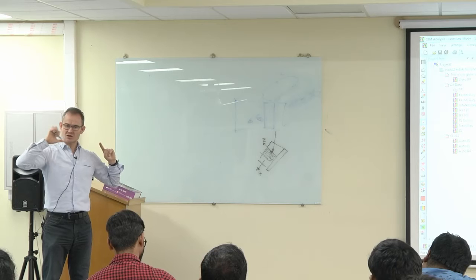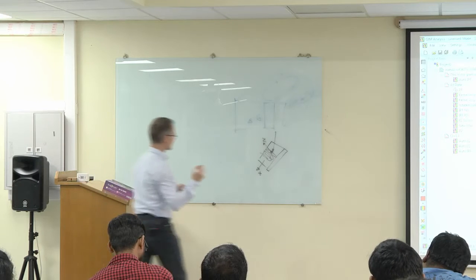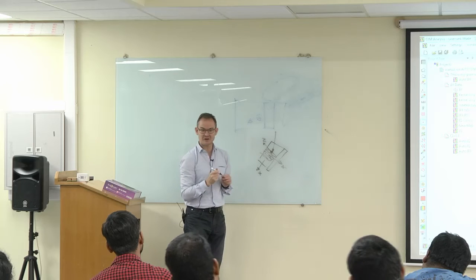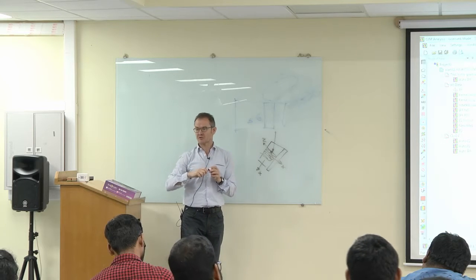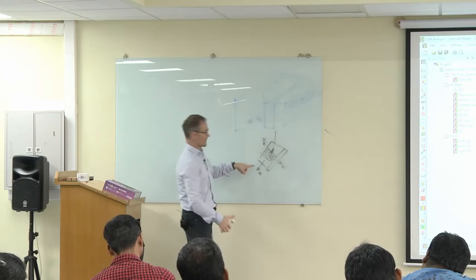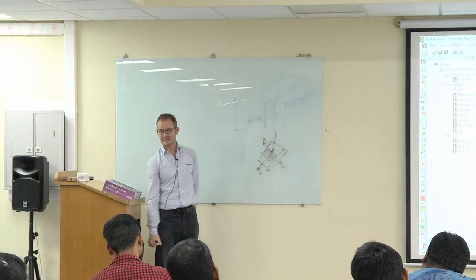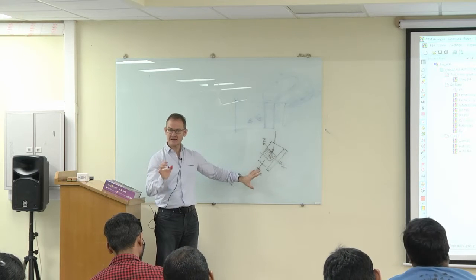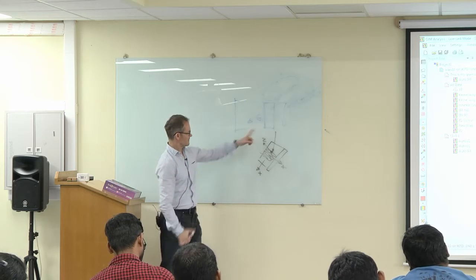If you are measuring with Oxford, then they assume actually that this one here is X and Z is out. Yeah? And of course, you can always select in the software and you say, this is not X, I will call this A. No, you can say this will be Y or so. No? You can select it, but by standard, by default, this is the selection.